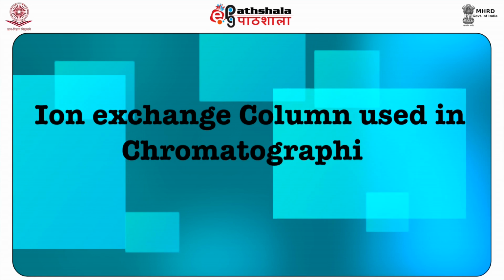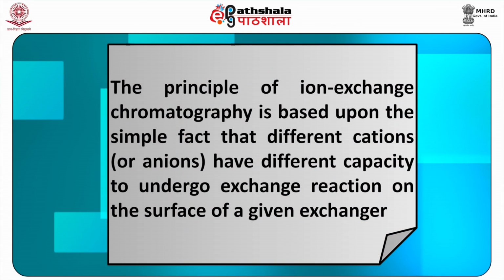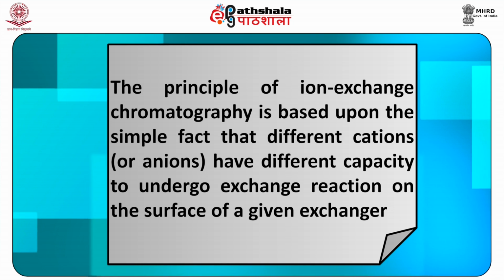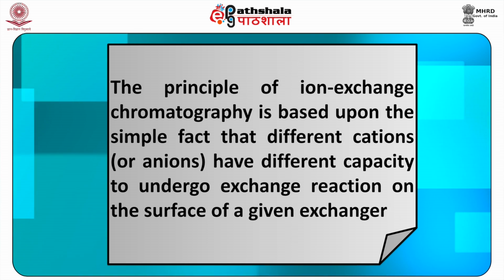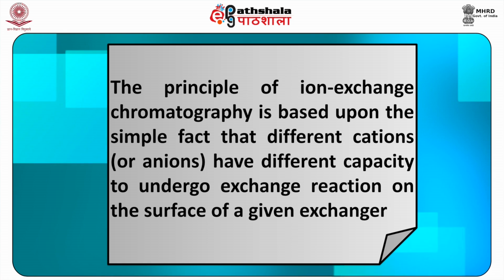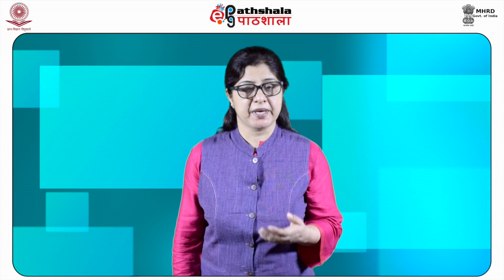Ion exchange column used in the chromatographic separations. The principle of ion exchange chromatography is based upon the simple fact that different cations or anions have different capacity to undergo exchange reaction on the surface of a given exchanger. The capacity of an ion to undergo exchange reaction has been found to depend upon the charge and the size of the hydrated ion in the solution.